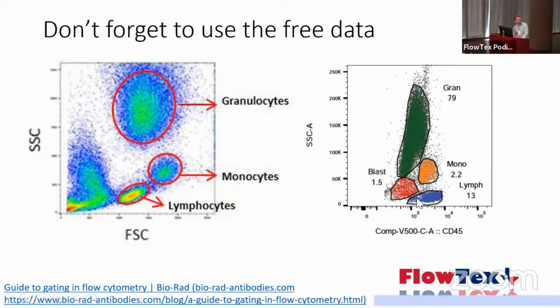And then just shown on the right, I think this is a bone marrow from a patient. But this is just a convention I'm going to use. This happens to be a lysed bone marrow sample where I got rid of a bunch of the red blood cells. And so we can see the lymphocytes here in blue because, you know, they're blue. That's what we made them. And so that's what they're going to be from now on. The monocytes will be in orange, granulocytes in green because alliteration. And then finally, this blast population, which is what we're going to talk about next. But this is the convention for the rest of the talk. So if you see cells in green or orange or blue or red, that's what it's going to look like going forward if you see it on a flow plot.